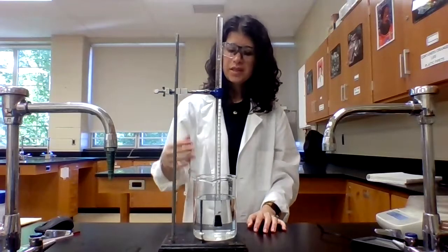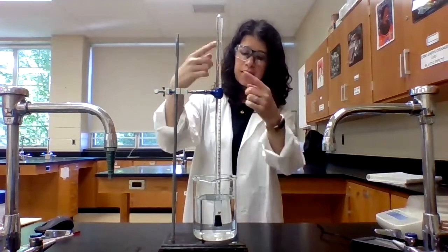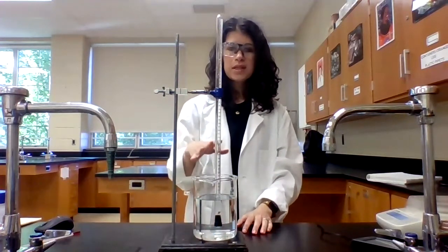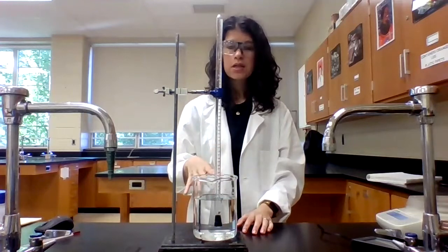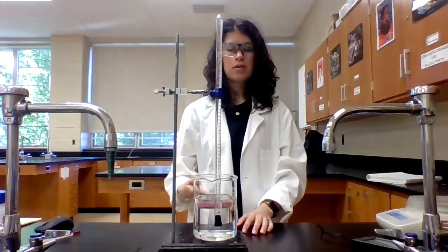So hopefully you can see the bubbles of gas that are being evolved from the reaction. As the hydrogen gas floats to the top, it then displaces the water into the beaker here on the ring stand. So we need to let this completely react. Again, it's important that all of that magnesium ribbon reacts because that's our limiting reagent.